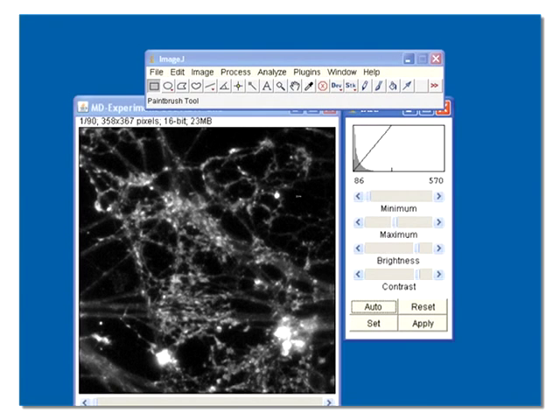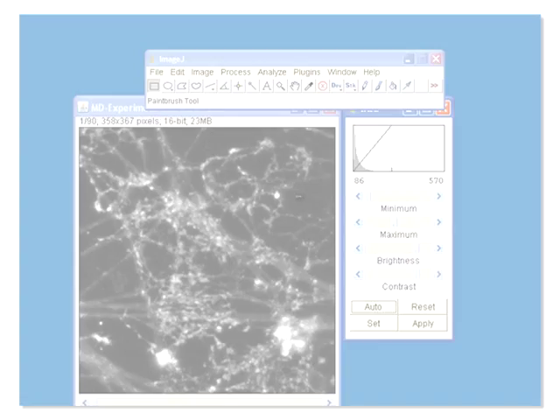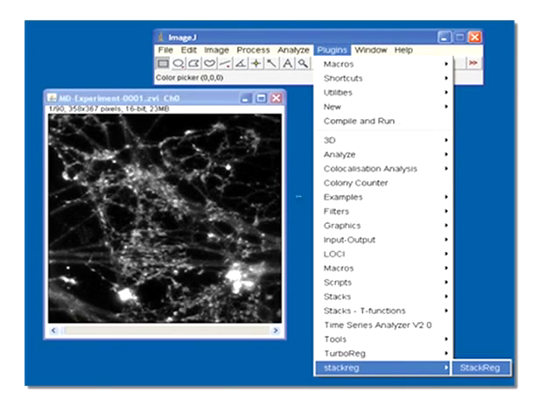For data analysis, convert the images to a stack using an ImageJ built-in function. Then adjust the brightness and contrast of the stack to maximize the dynamic range. If significant horizontal drift has occurred during the experiment, run StackReg and TurboReg plugins on ImageJ to align the image stack. Then, run Time Series Analyzer plugin.